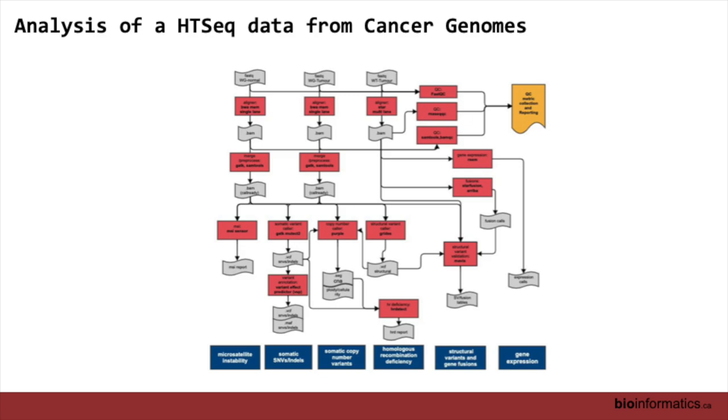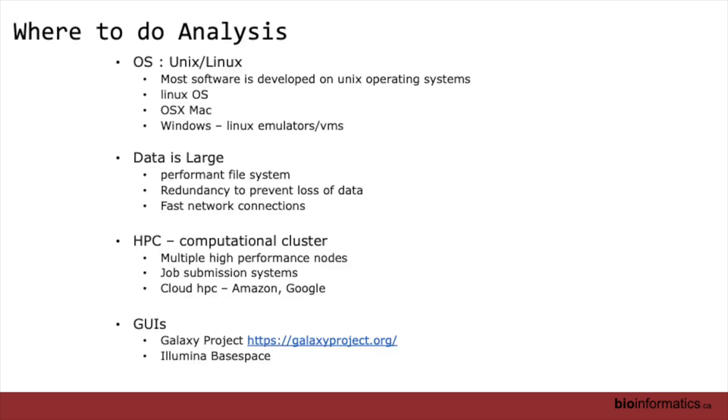I'll jump ahead here, and we're really just going to focus on one part of that pipeline. We're going to bring this through from beginning to end, starting with raw data, doing alignments against the reference genome, and I'll talk about that in more detail. And then once we've done those alignments, we could do some pre-processing, some cleanup of the data, then running a tool to generate somatic variant calls, and following that up with annotation of those variant calls, information that's important for the downstream review processes.